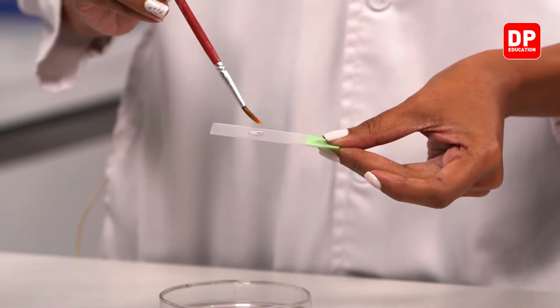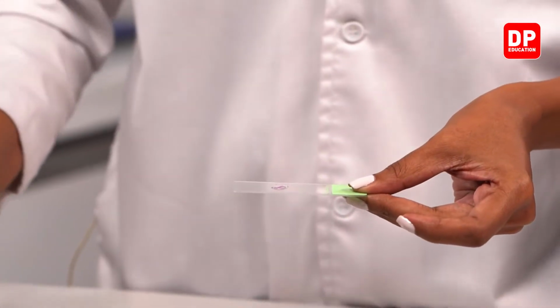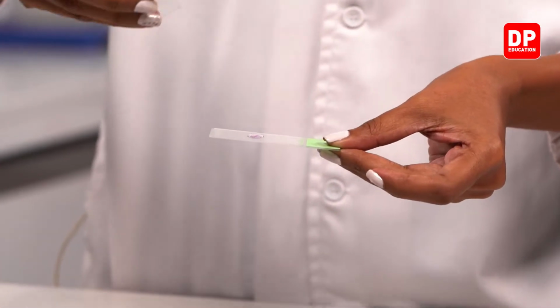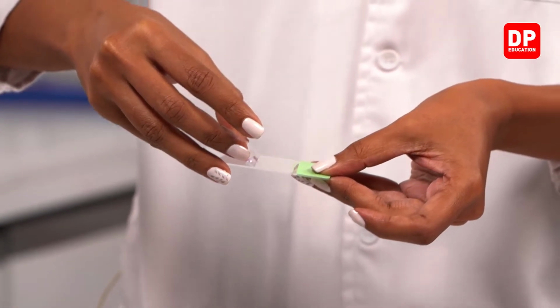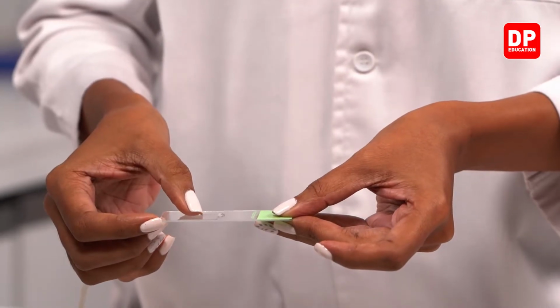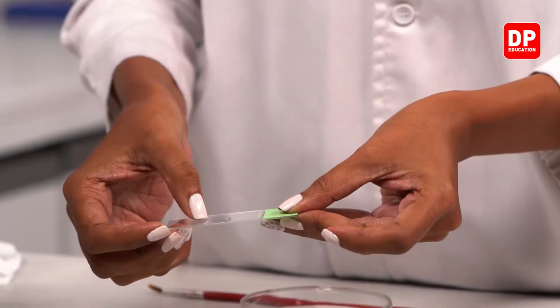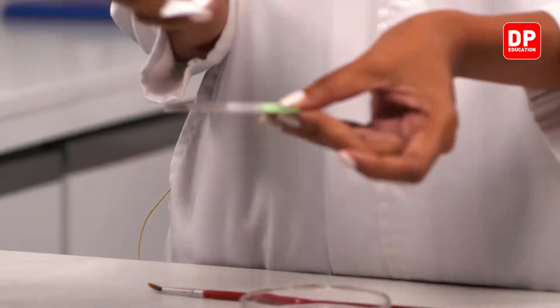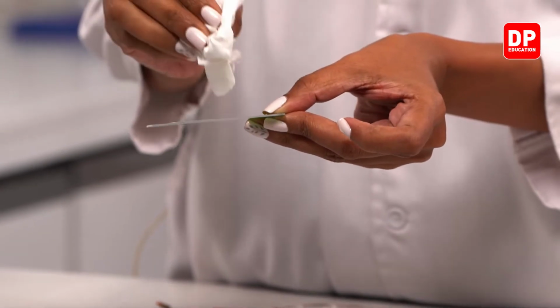So sometimes instead of a drop of water, we can put a drop of glycerin as well, okay? Right. In the same way, I'm going to hold it like this and drop. So you all can see there are no water bubbles, it's all clean. And you need to wipe off the excess water.